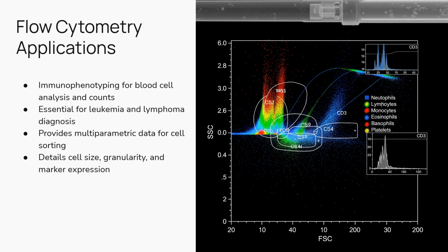for therapeutic use. For another assay, we could do a functional assay, and it assesses cell activation, cytokine production, or apoptosis. For minimal residual disease detection, it detects small numbers of malignant cells post-treatment, which is crucial for patient prognosis. It can also look at stem cell analysis, HLA typing, and transplant monitoring.